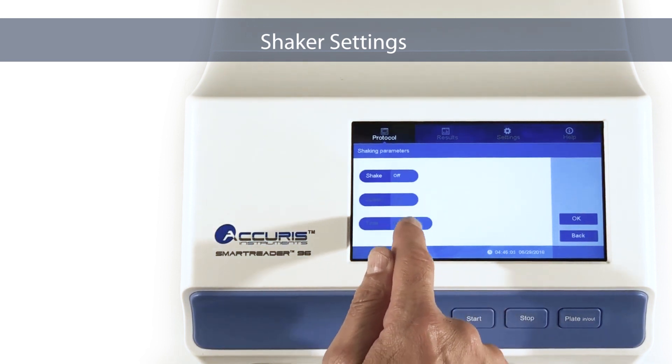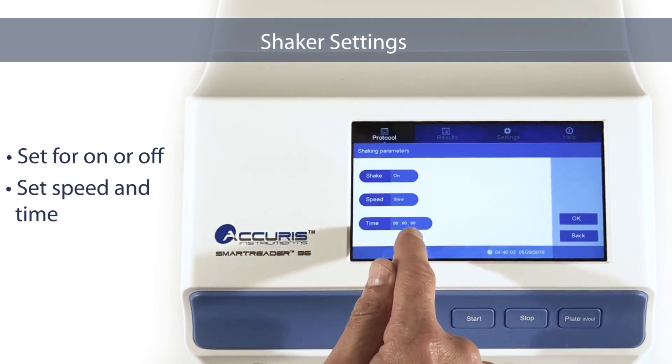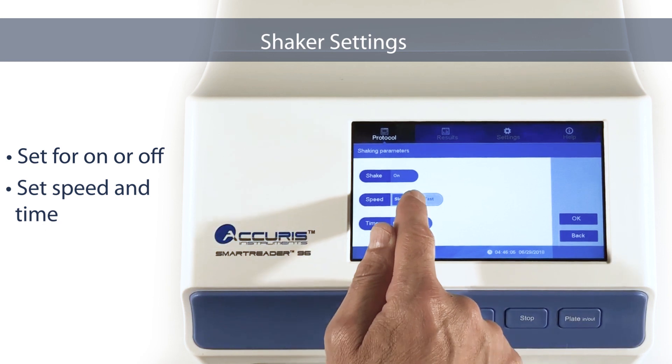Shaker Settings. Press the Shaker Settings section to set plate shaking on or off. Choose the shaking speed and also select the shaking time.